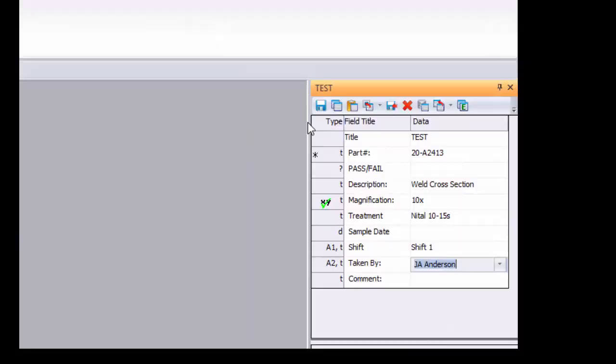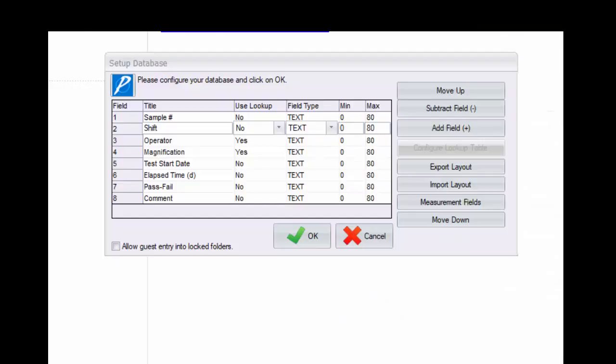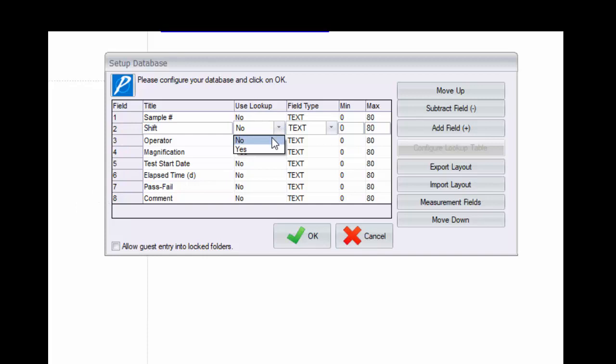Our shift field lends itself well to a lookup table so we'll specify that option by choosing yes in the drop down list. Doing so activates the configure lookup table button to the right. Click this button to create your list.